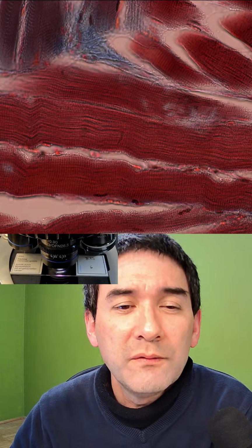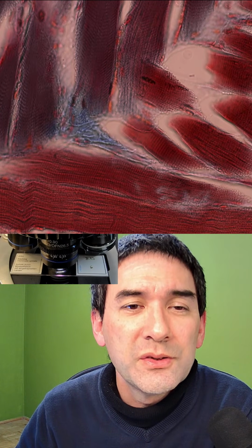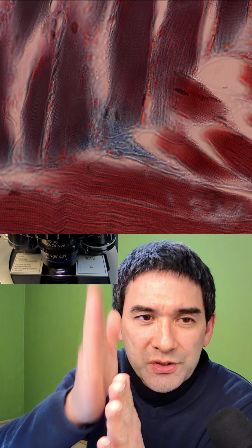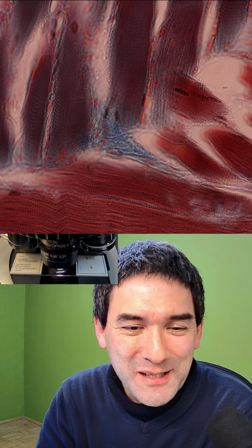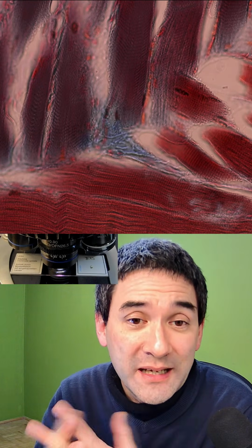And if you are very careful, and I know that I've been mentioning this already before, also in other live streams and videos, if you look very carefully, then you're able to see that those muscle fibers have those fine stripes. They're called striations. And those striations are actually a little bit like a test on how good your microscope is. Those striations are called the light and the dark bands. My students have to know this for their biology exams, and they're very typical of so-called striated muscles.